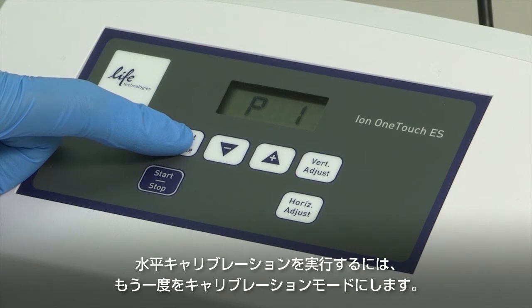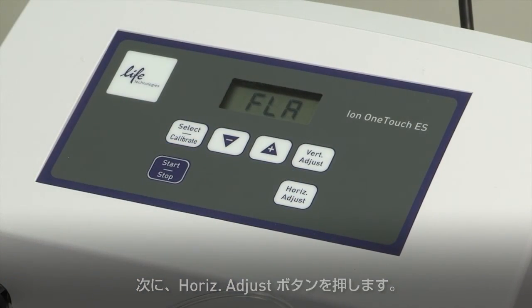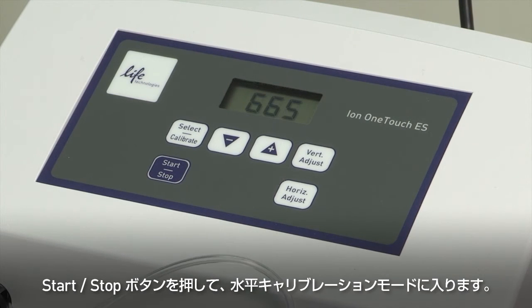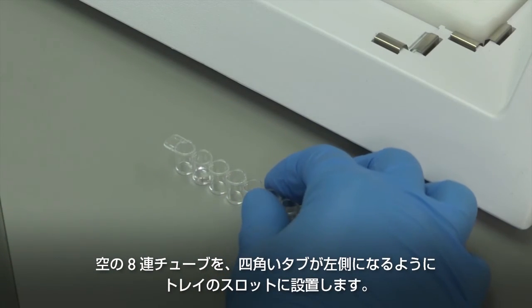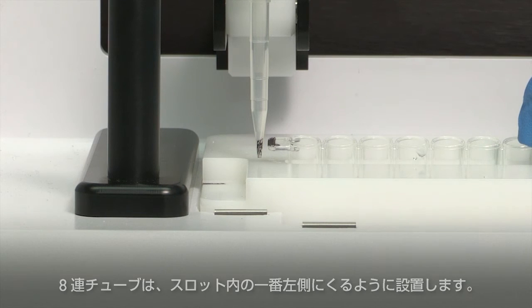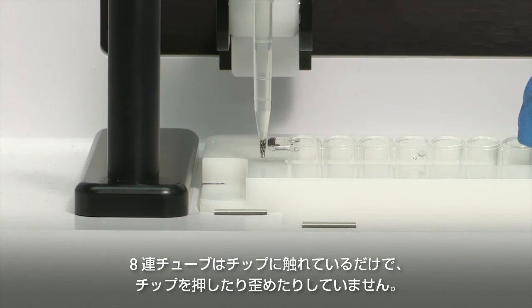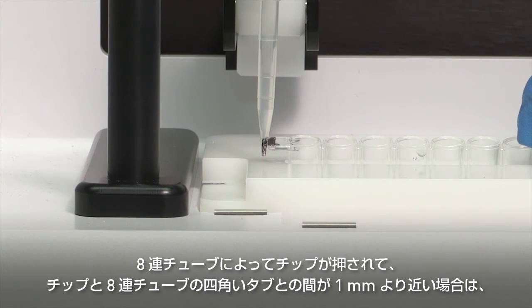To perform horizontal calibration of the instrument, put the instrument into calibration mode. Press Select Calibrate for three seconds until the instrument beeps two times and Cal is displayed. Next, press the Horizontal Adjust button. The ES will display FLA. Then press the Start-Stop button to enter the horizontal calibration mode. The tip arm will lower and move the tip into a horizontal reference point. Place an empty 8-well strip in the slot in the tray with the square tab on the left and push the strip as far left as possible in the slot. Observe the position of the strip relative to the position of the tip. When properly calibrated, the strip is touching but not pushing on or deflecting the tip.